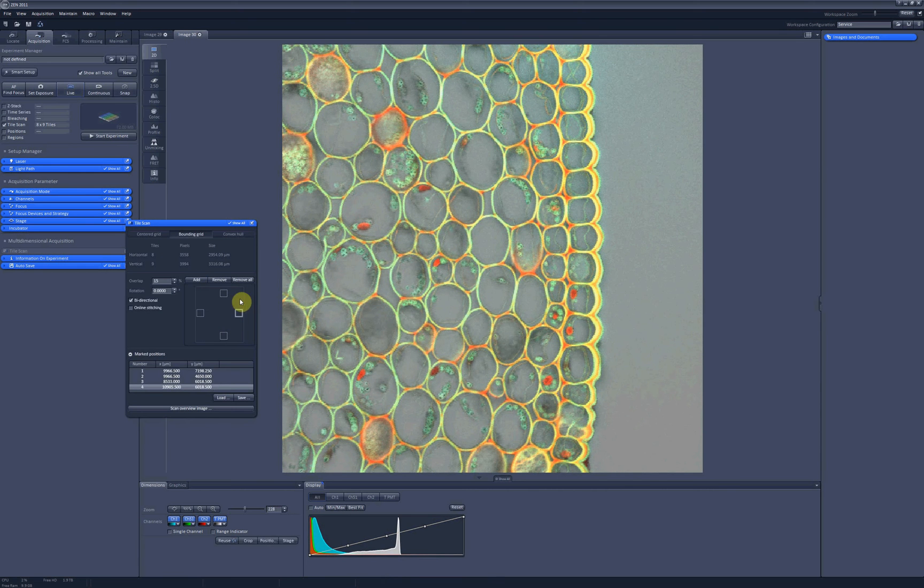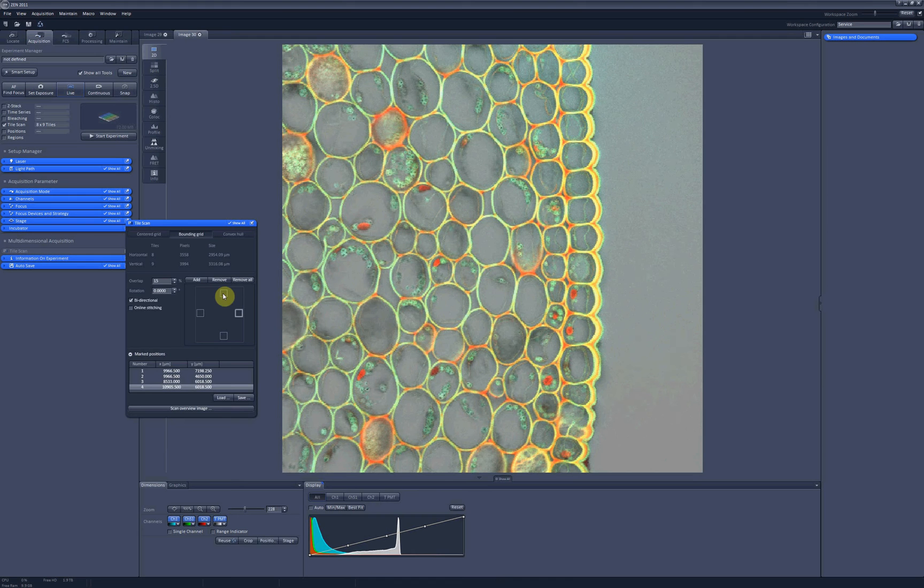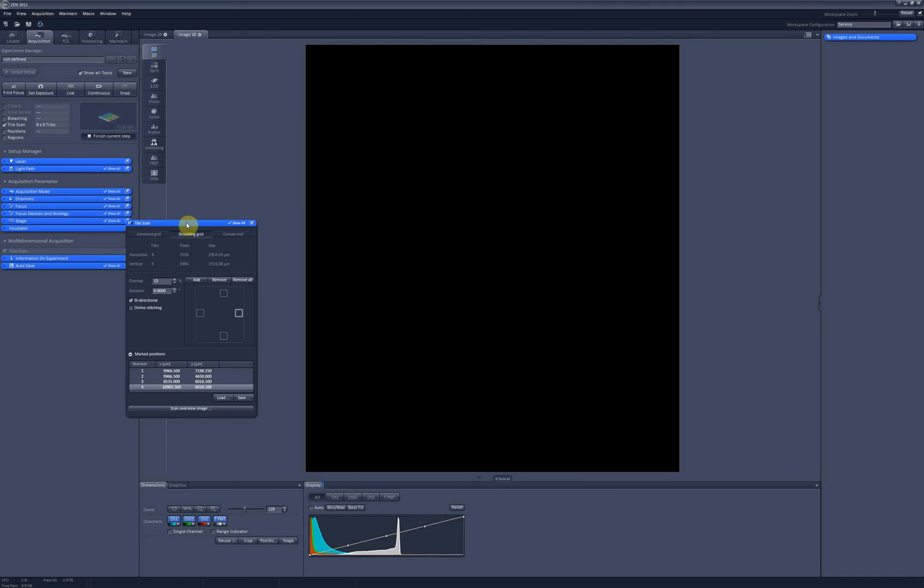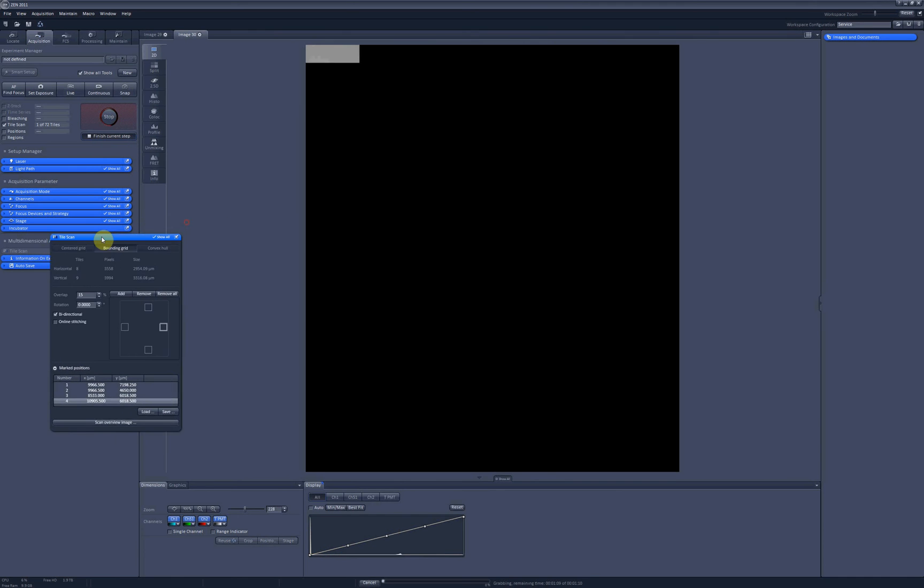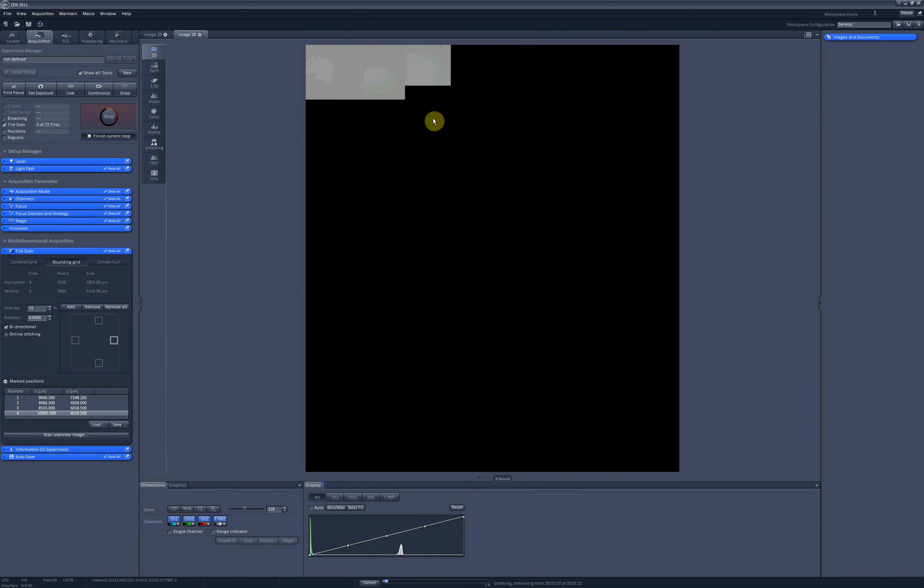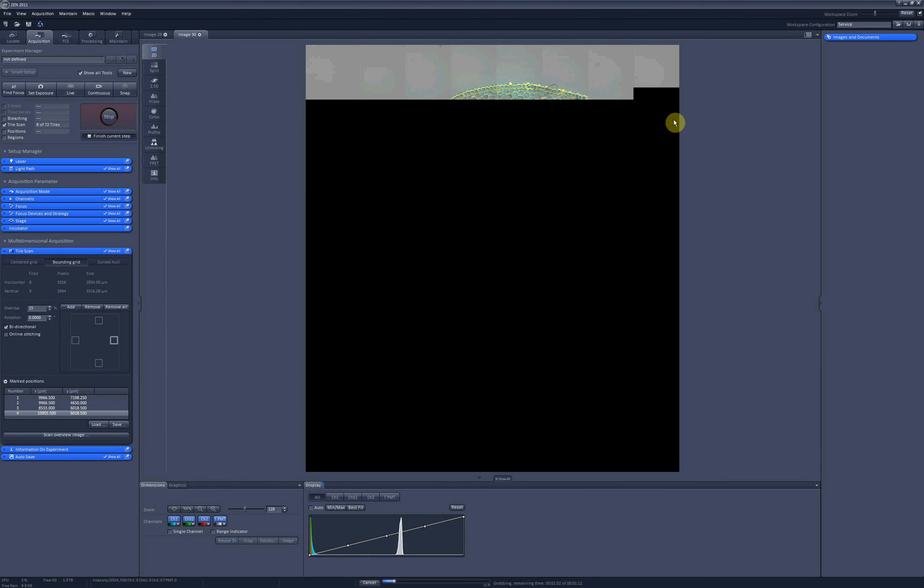As you can see, the software estimated the area I need to scan, and then it calculated the number of tiles I need to cover this area. And when I click on start experiment, I will see that my sample is now nicely covered with tiles.